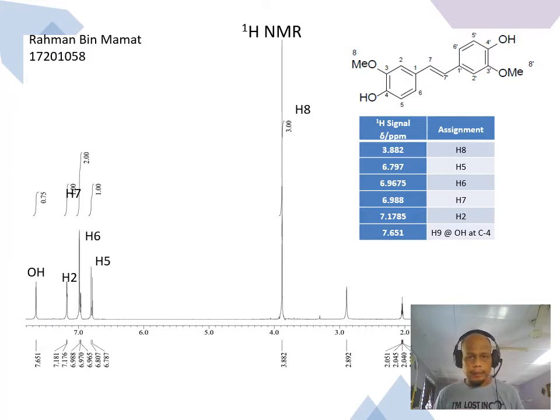From this assignment, these compounds actually have a similar chemical shift.